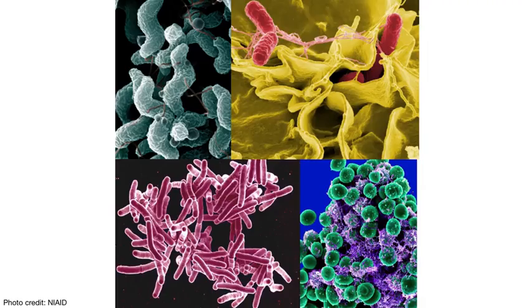Once we have all of the sequence data back from our samples, we then have to use the sequences to distinguish the microbes, like these microbes, from each other. We'll learn how to do that next week.